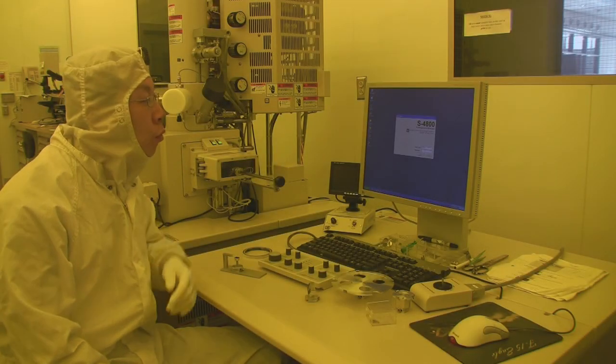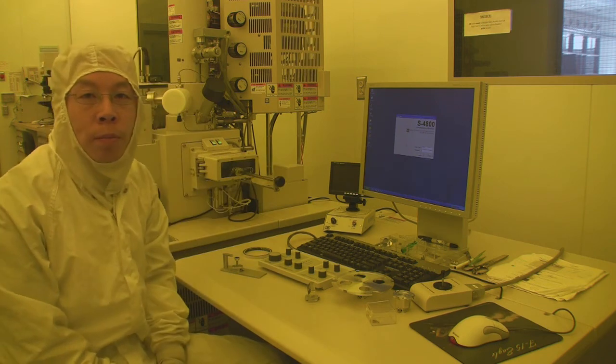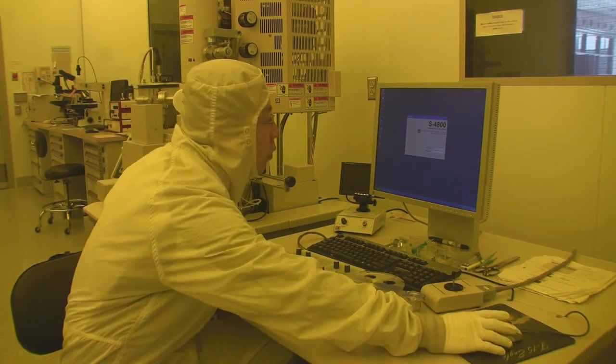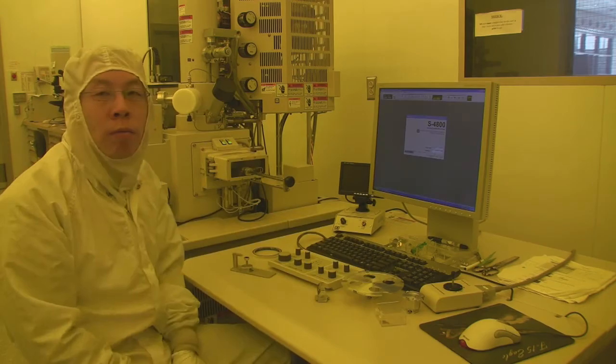Today I'm going to show you how to use the Hitachi 4800 scanning electron microscope. After you log in, this program will automatically load. We don't have a password here, so you just click OK and then the program will be loaded.